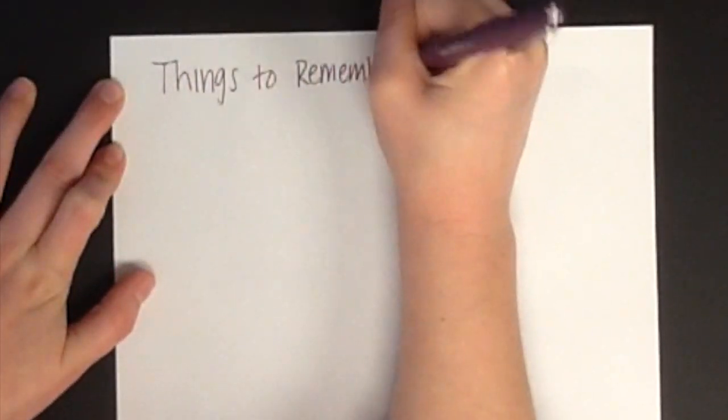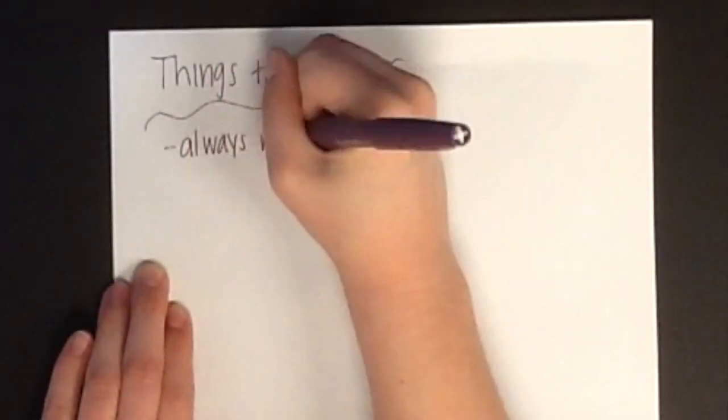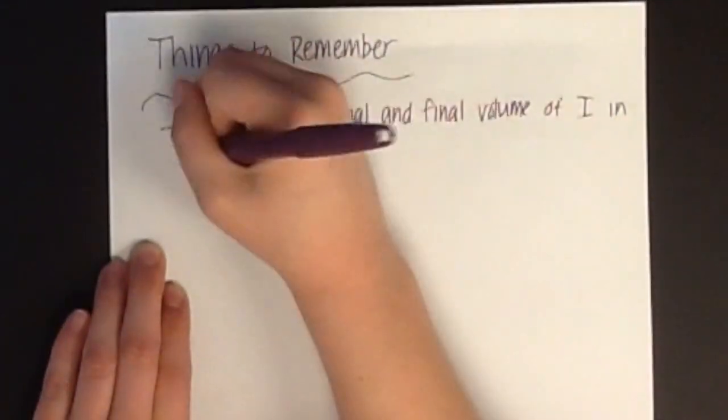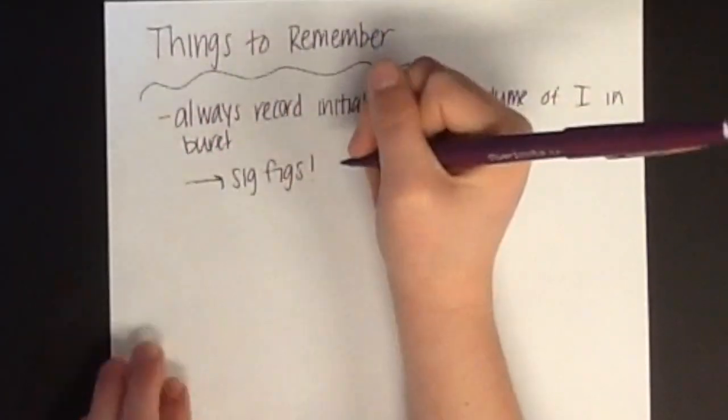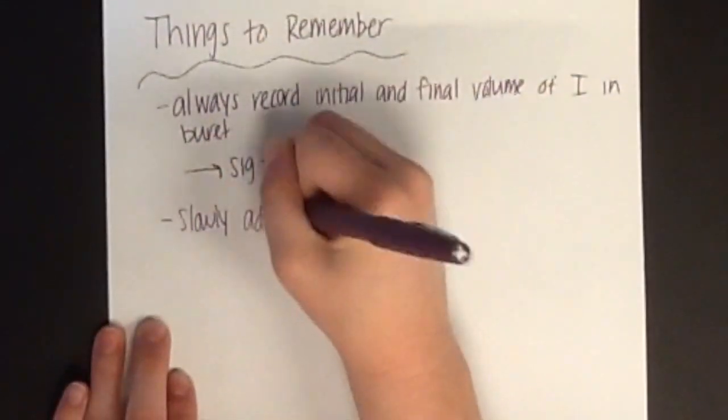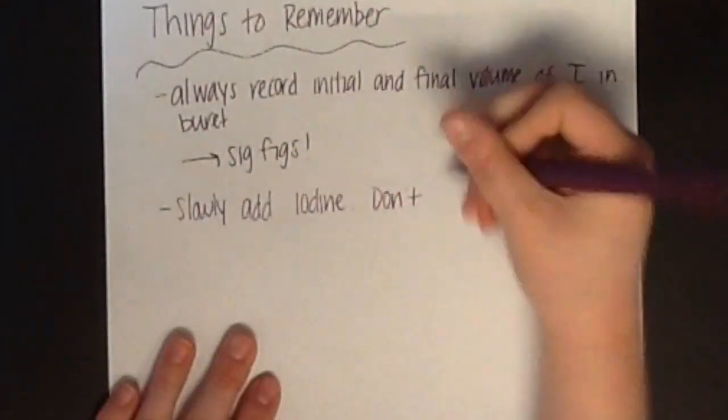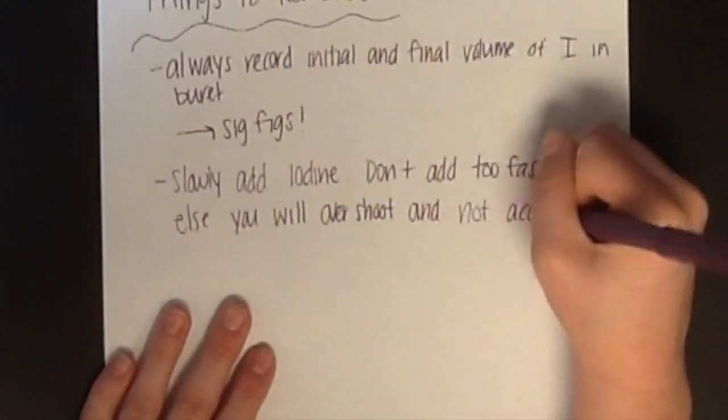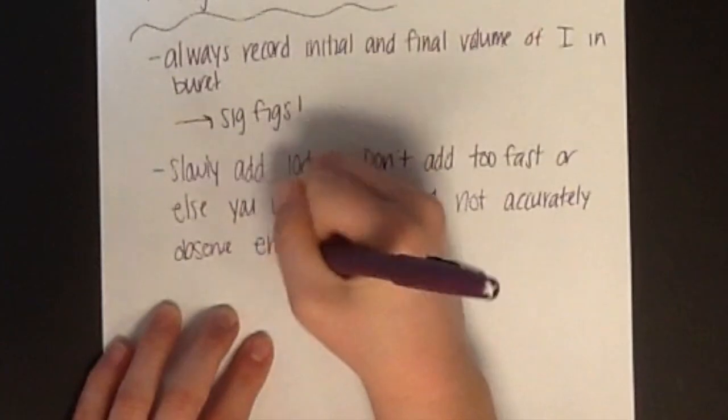Some things to remember include: 1. Always record the initial and final volume of iodine in the burette by using the correct number of significant digits. 2. Slowly add iodine by turning the stopcock. Adding too much, too fast, could cause you to overshoot and not accurately observe an end point.